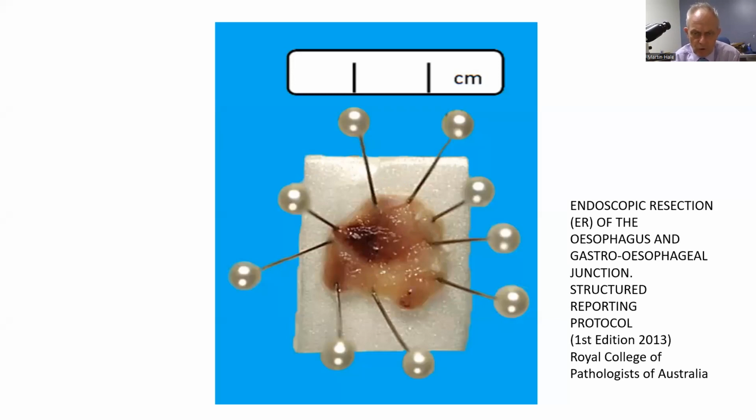But what is very important is the material that you pin it onto must remain rigid. Because when this tissue gets into formalin, it curls up at the edges. And when things curl up at the edges, it makes the processing and the dissection of that specimen almost impossible, particularly if it's thin and particularly if it's small. And in fact, you effectively undo all the good that has been done during the operative procedure. So it must always be pinned out.